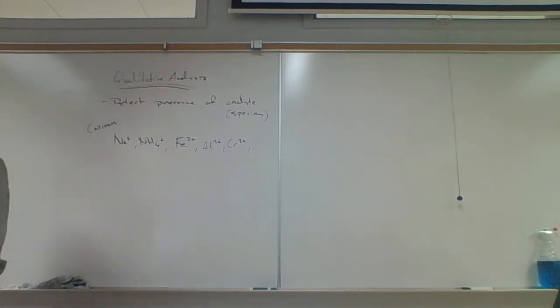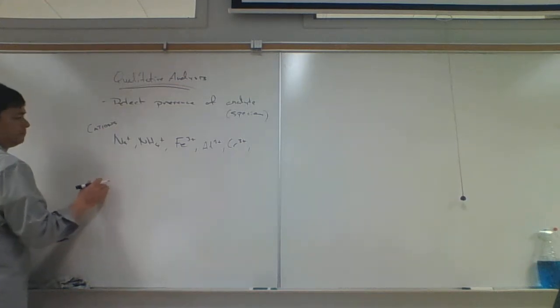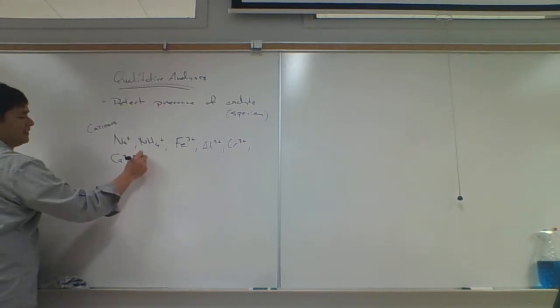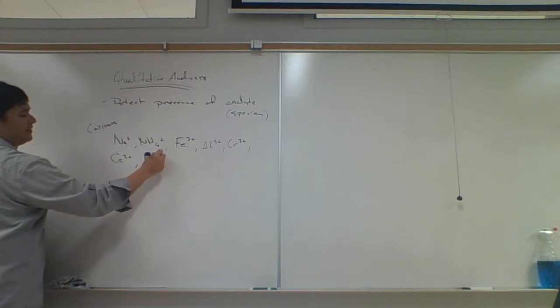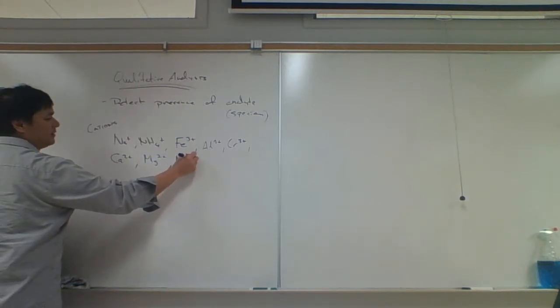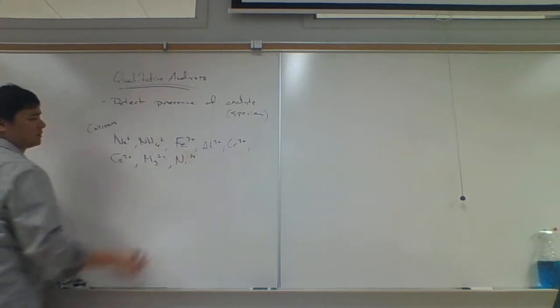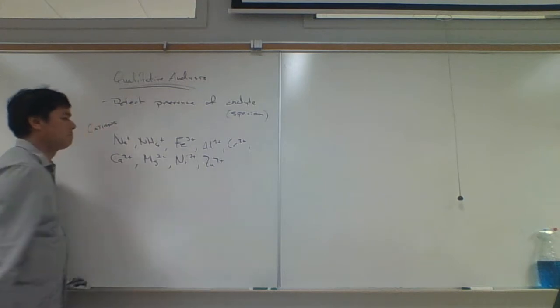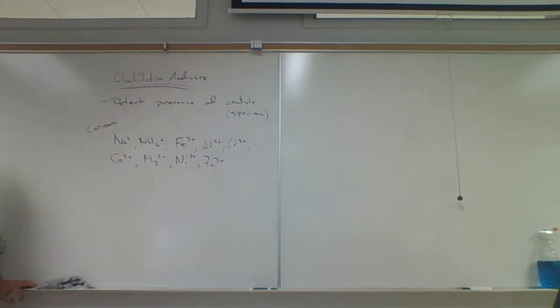Okay, so what I'd like you to do is follow along with me with the lab manual. It's going to be qualitative analysis. So you'll see calcium 2+, magnesium. I heard somebody say nickel, zinc, and one more. Silver.